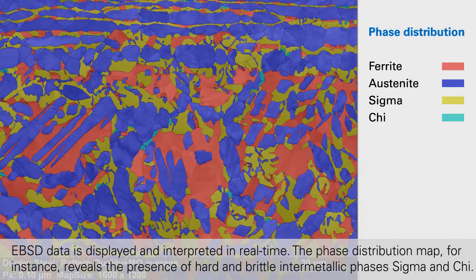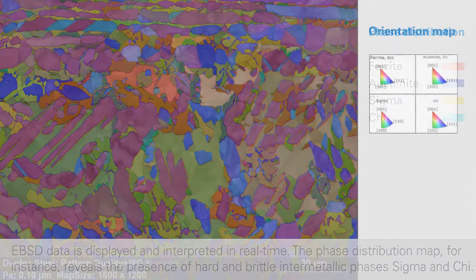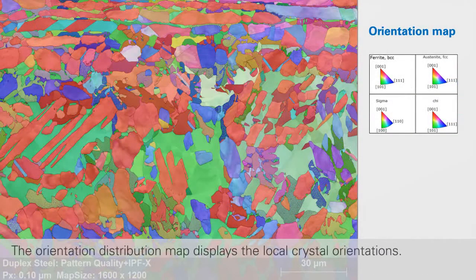The phase distribution map, for instance, reveals the presence of hard and brittle intermetallic phases sigma and chi. The orientation distribution map displays the local crystal orientations.